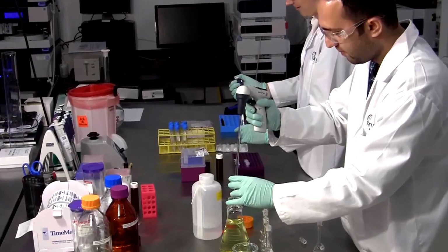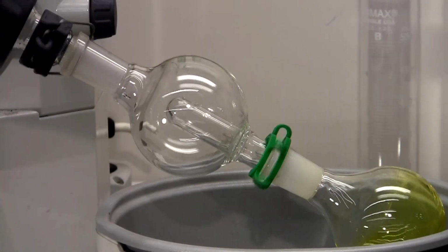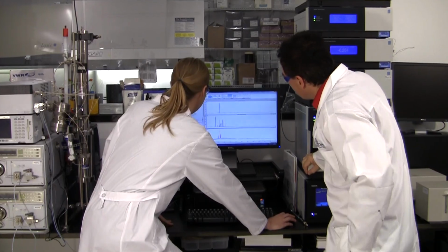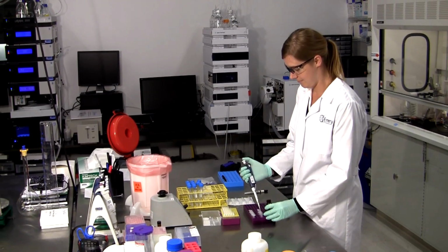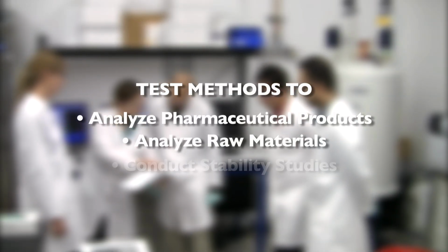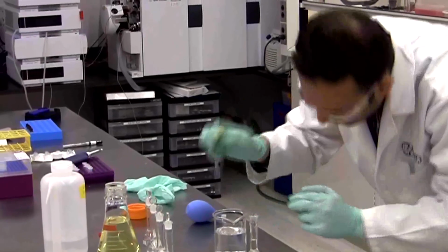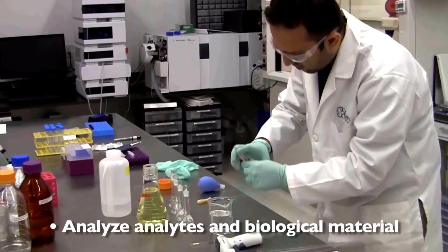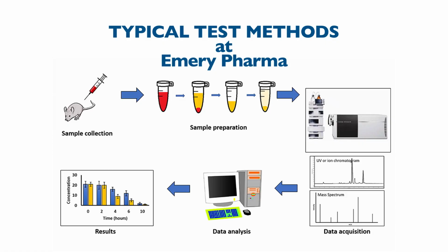Here at Emery Pharma, we provide our clients with R&D, GLP, and GMP support in the areas of chemistry and biology. We routinely develop and validate new test methods and apply them to serve our clients' needs. These test methods can be used to analyze pharmaceutical products, raw materials, or conduct stability studies. Additionally, these test methods can be adapted to analyze analytes in biological material, such as urine or tissue samples from animal or human studies. Let's review a typical test method.